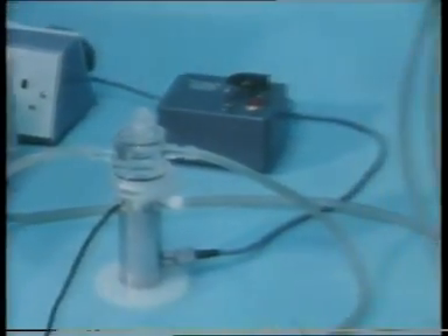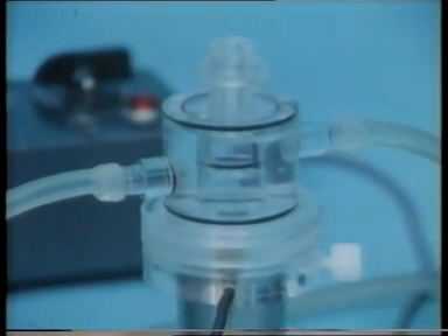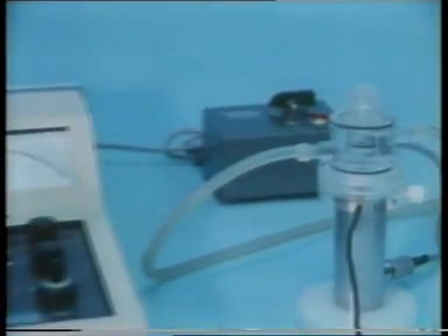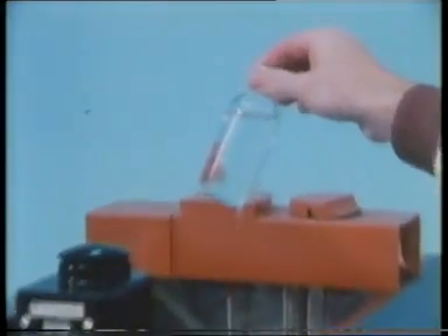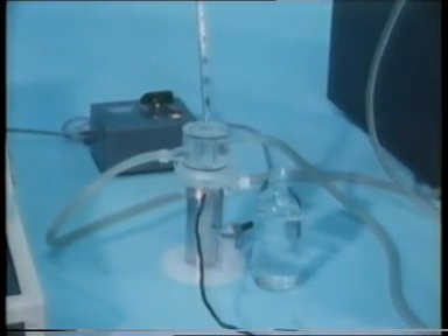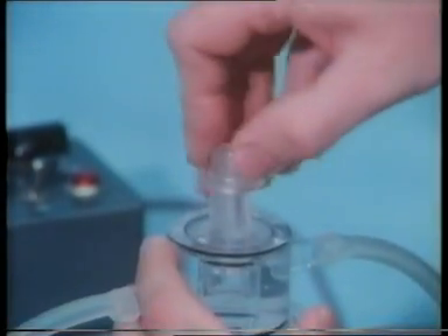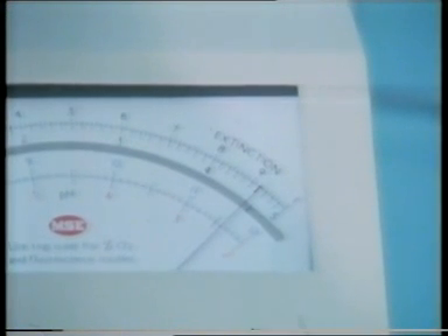Here's the oxygen electrode set up ready for use. It's jacketed with water at 30 degrees centigrade from a thermostatically controlled water bath. The current produced by the oxygen electrode is proportional to the concentration of dissolved oxygen in whatever solution is present in the reaction vessel. This unit has a voltmeter and paper trace recorder to measure the voltage produced on amplification of that current. First, a demonstration: here's some well aerated water. If we put some into the reaction vessel, it must be kept well stirred, hence the magnetic stirrer. The voltmeter indicates that there is oxygen dissolved in the water.